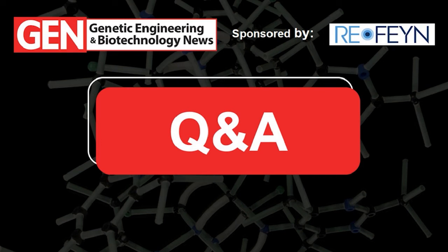All right, thank you for that. Here's a pretty good question, I think. An audience member would like to know, can mass photometry be used to quantify the virus titer? So that is an interesting one. We cannot at this point quantify a concentration of molecules. So with relative concentration, we are quantitative, but with absolute concentrations, we are not at this point. The main reason is that we are very, very sensitive in terms of single molecule counting.